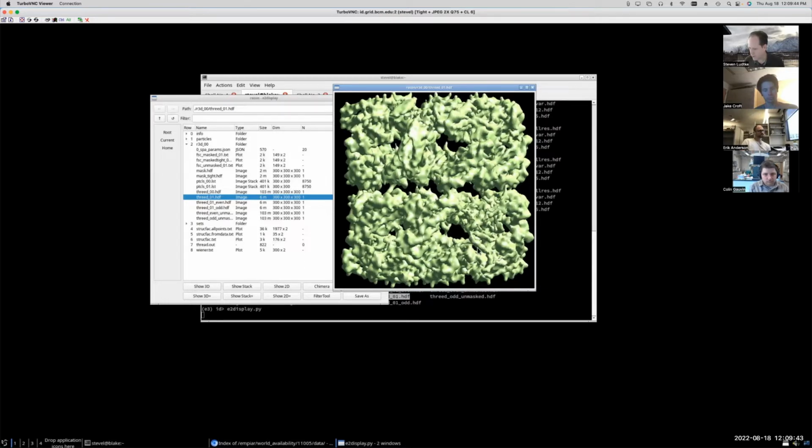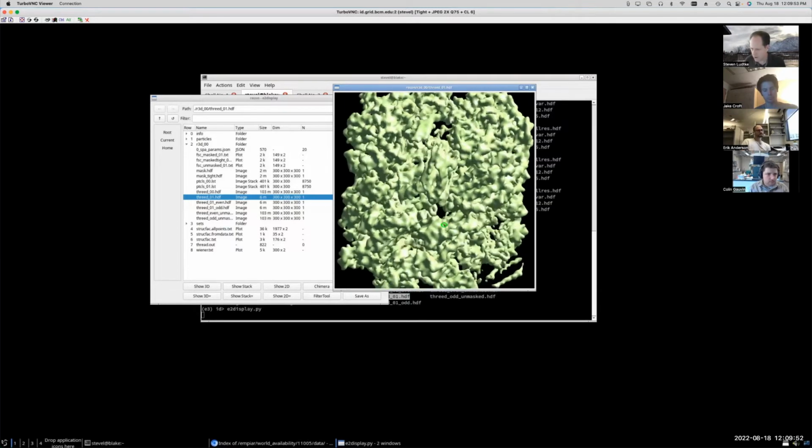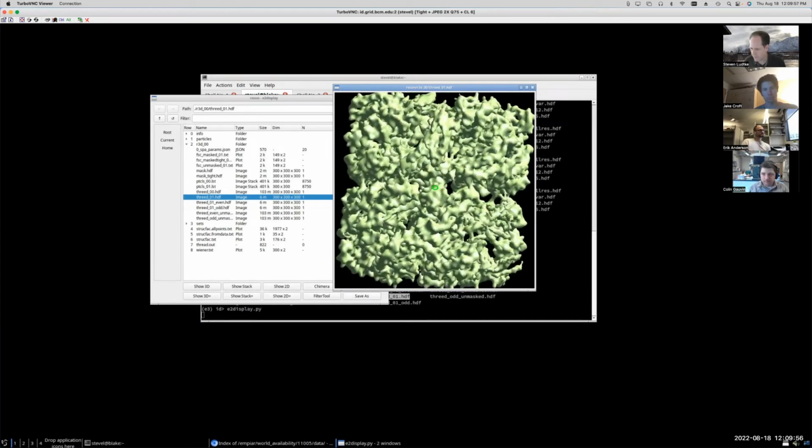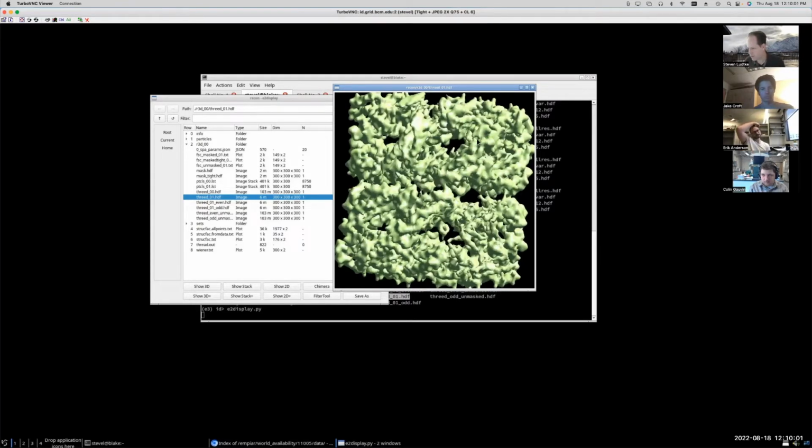But if the subunit isn't missing in a particular particle, then that's not going to help at all. It's just going to align anywhere if it's there, which is fine. But then the one that's moving, if it's only out of position a little bit, it doesn't look very different than its neighbor and that sort of thing.